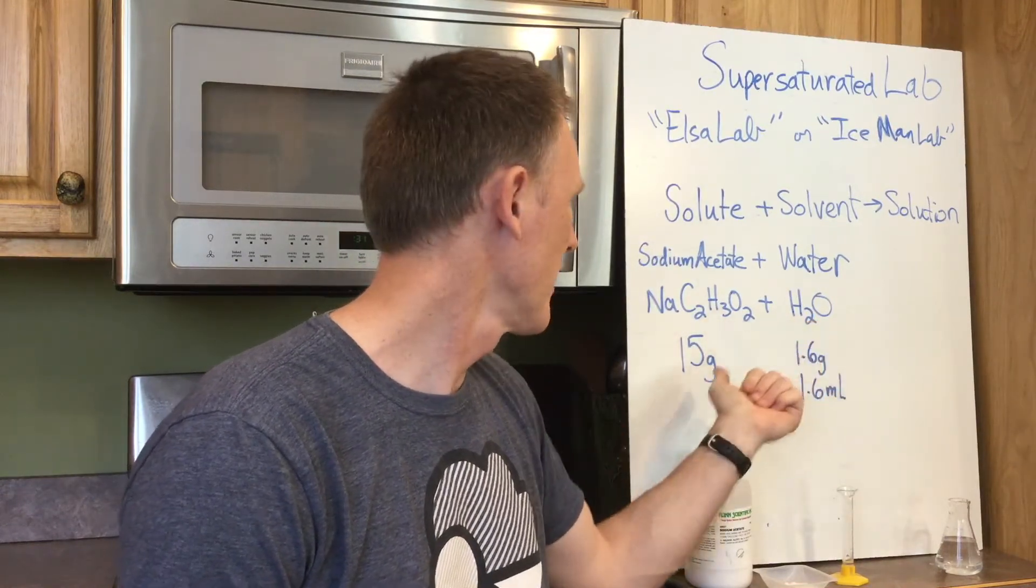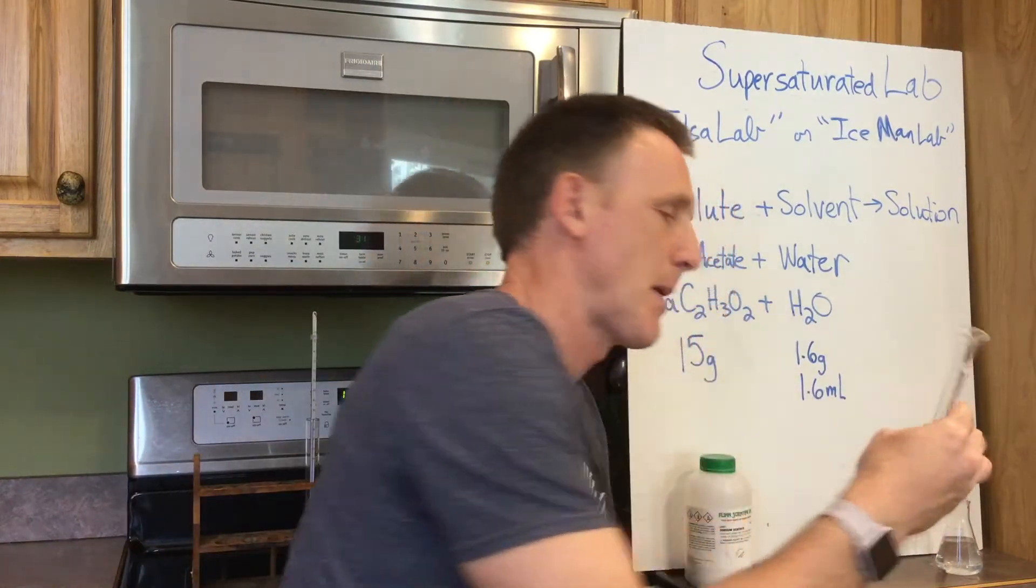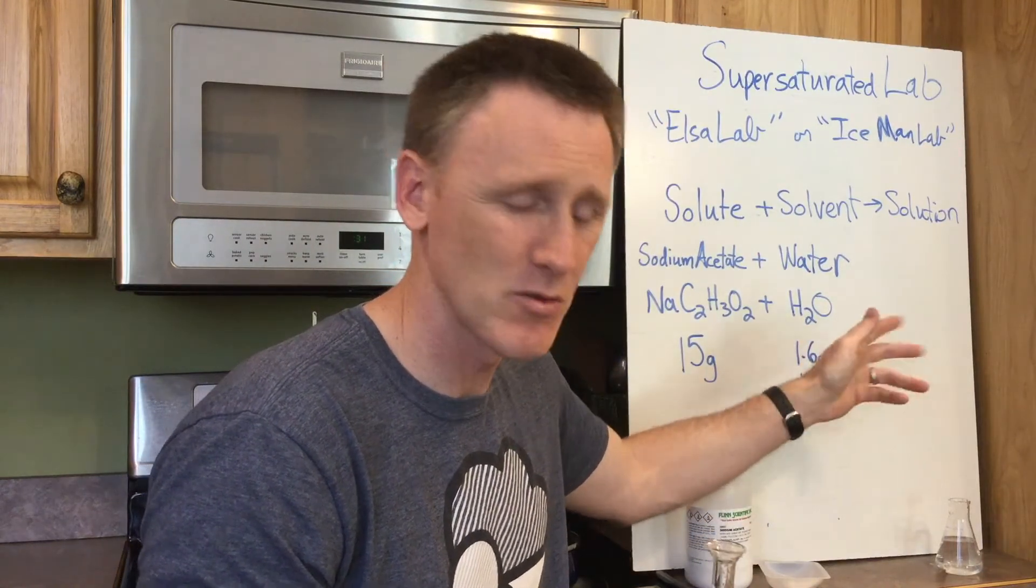We also have water. Now if you look at this, we're going to use 15 grams of sodium acetate and 1.6 milliliters of water. Remember, water's density is one, so I can call it either 1.6 grams or 1.6 milliliters. I'm going to put them together and form a solution, let's try it out.